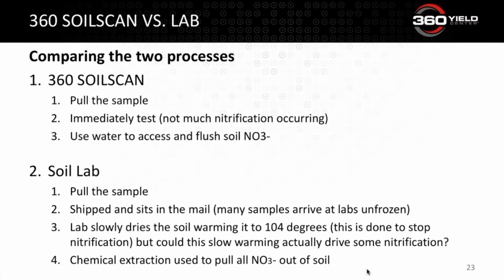The other thing to remember about labs is there are different extraction techniques. Some will use a cadmium extraction, a chemical extraction to physically pull all the nitrates out of the soil, whereas we're using water, which is what the plant is experiencing in the soil. So we use water, they use a chemical extraction.